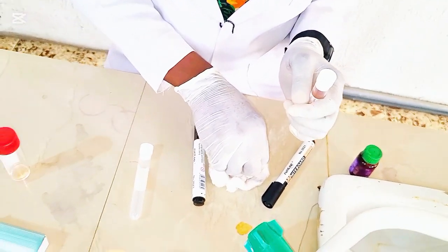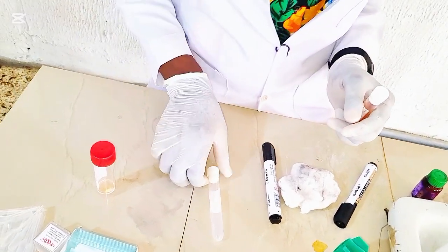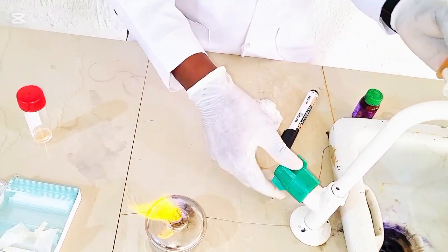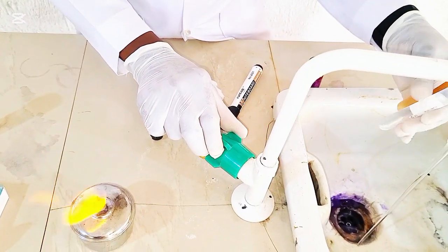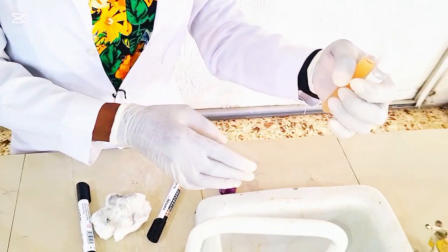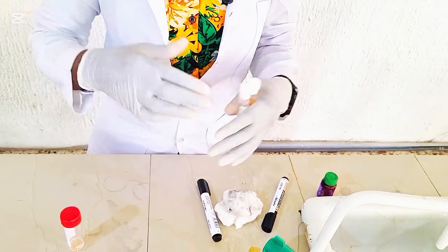Now, because we don't want to spoil our centrifuge, we must always balance the centrifuge when spinning samples. So I'll put an equal volume of water into a second centrifuge tube, and then we'll use it to balance the centrifuge in the opposite direction to balance the weight.